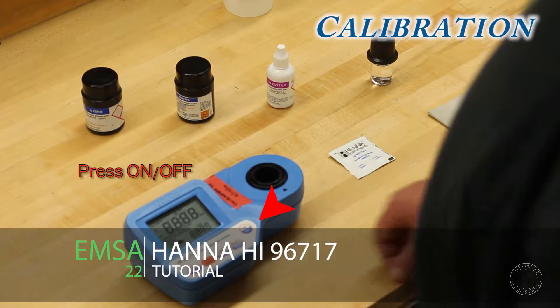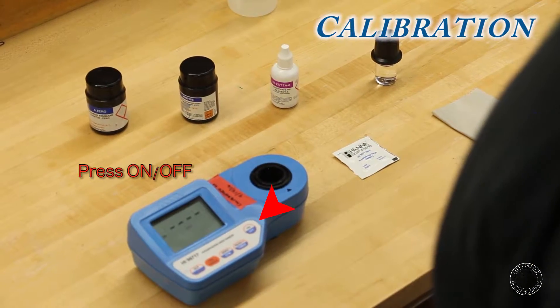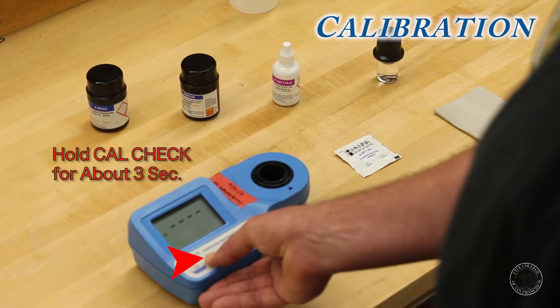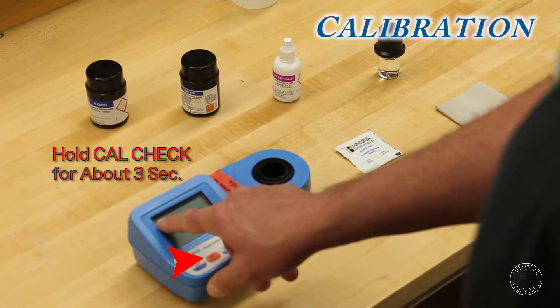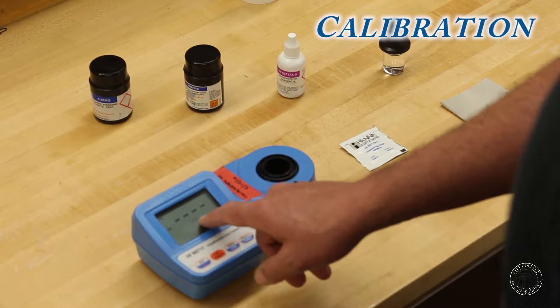We'll start by turning it on. And then to enter calibration mode, you'll just hold the CalCheck button for approximately three seconds. Then you'll see that the calibration mode has been enabled. Now the machine wants to be zeroed.